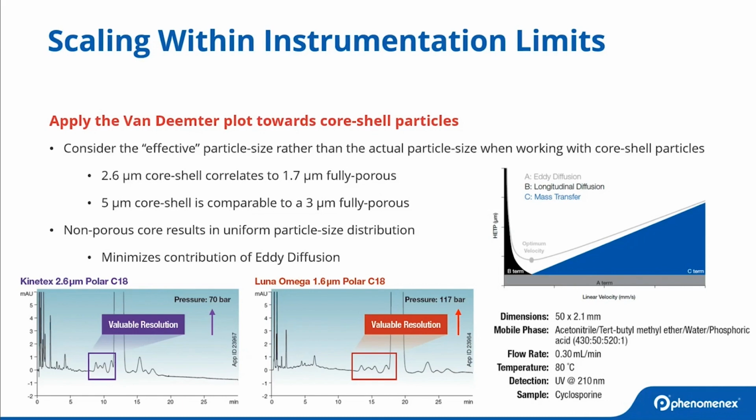The only caveats of which to be mindful are that fully porous particles do lend themselves to higher sample loading, and so as a result, it does work out when you do have ambitions of scaling up to preparative purification, for which fully porous particles are often preferred.